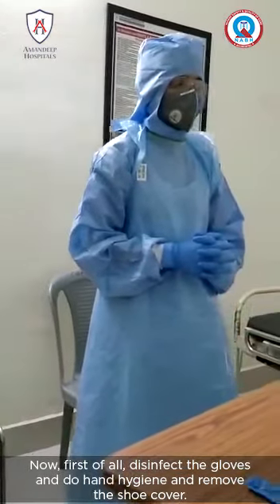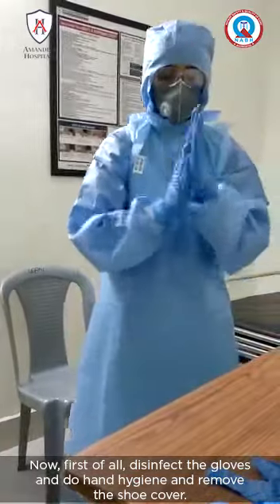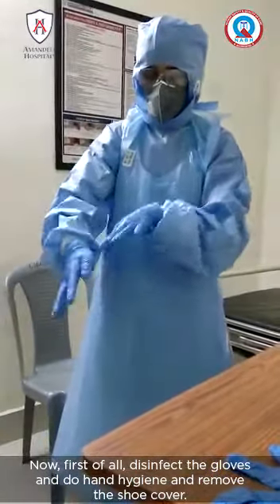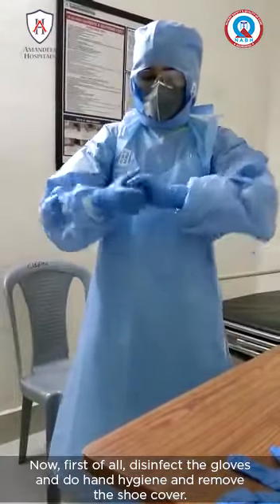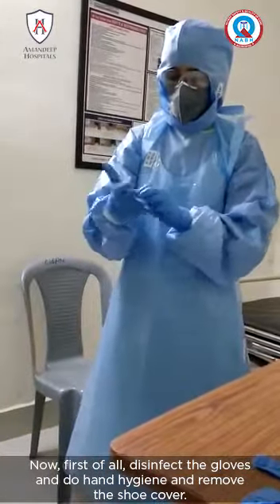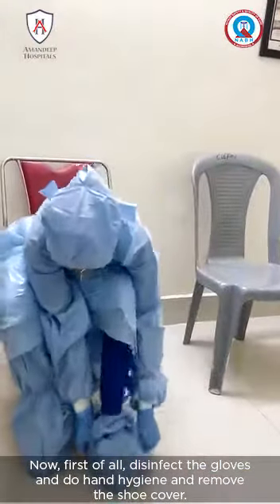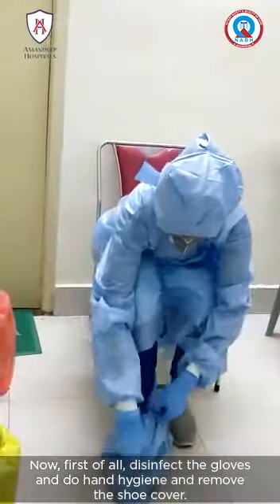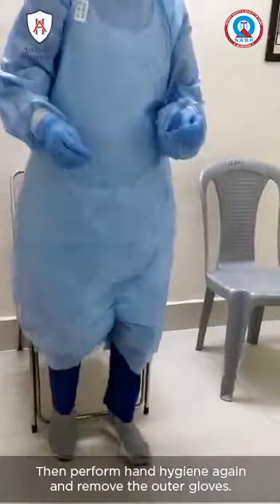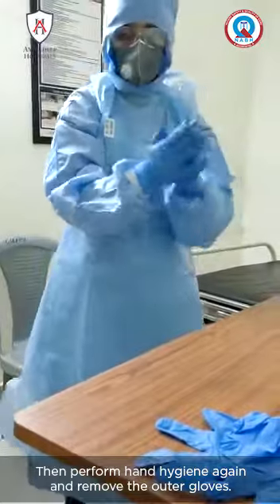First, disinfect the gloves, perform hand hygiene, and remove the shoe cover. Then perform hand hygiene again and remove the outer gloves.